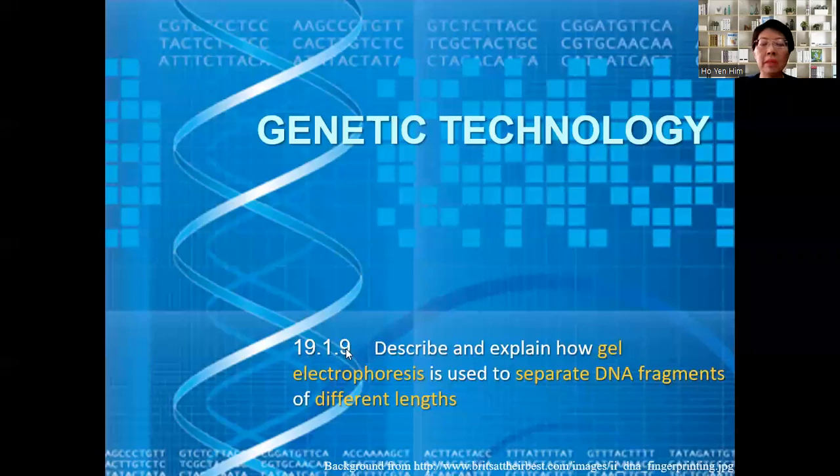So the learning outcome says that the candidate needs to be able to describe and explain how gel electrophoresis is used to separate DNA fragments of different lengths.